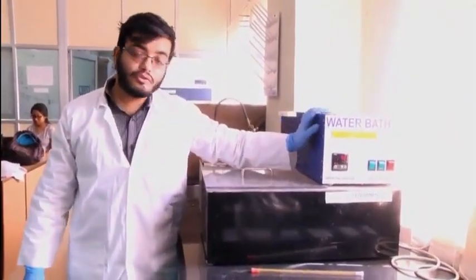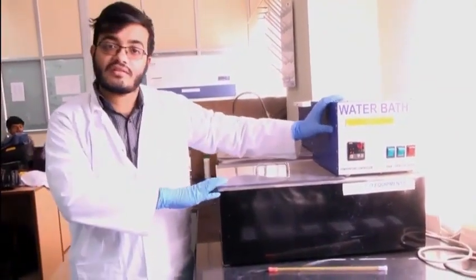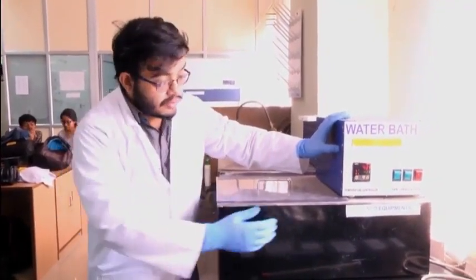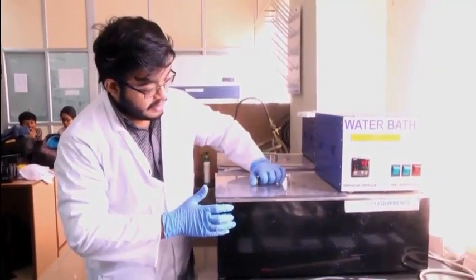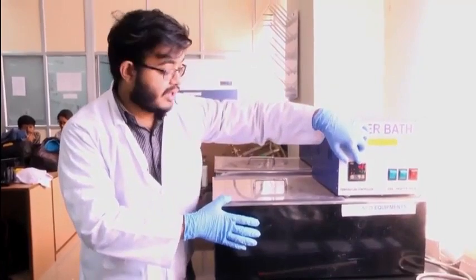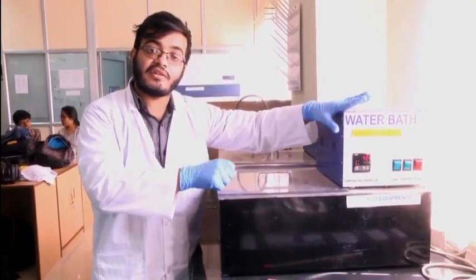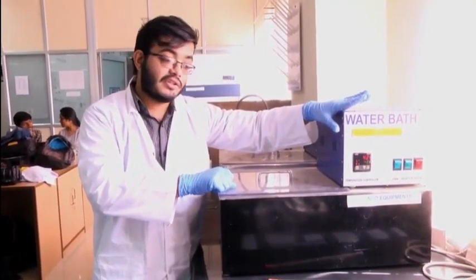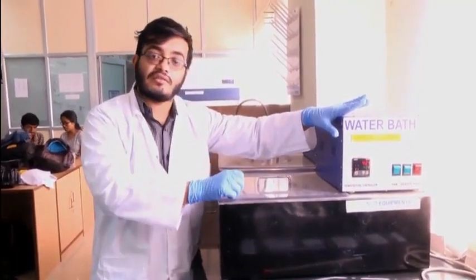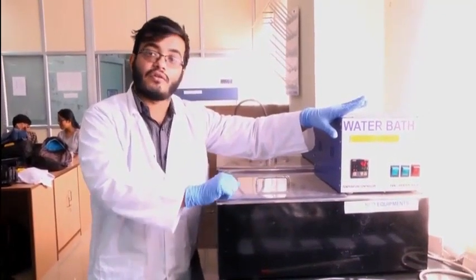You have already been introduced to the dry heat block, but apart from that we also have water baths in our laboratory. So this is the water bath, and this portion of the tank has water which is maintained, for now, at 42 degrees centigrade. That is because later on today I'll be doing an experiment in which I require the temperature to be at 42 degrees. I will take my sample in a centrifuge tube and I will just keep it inside this water bath. It will float inside the water bath and the reaction will be incubated at 42 degrees.